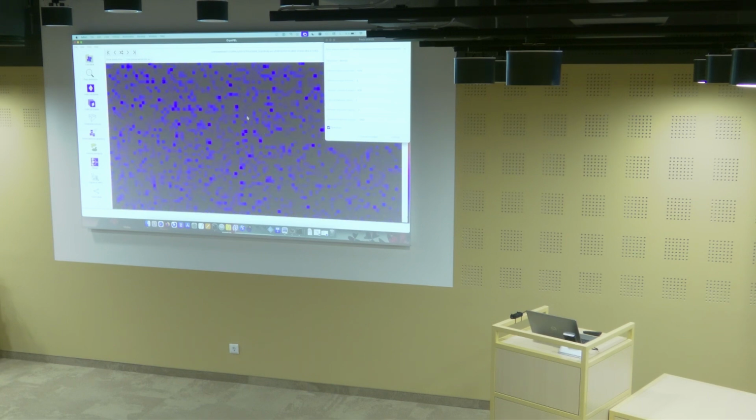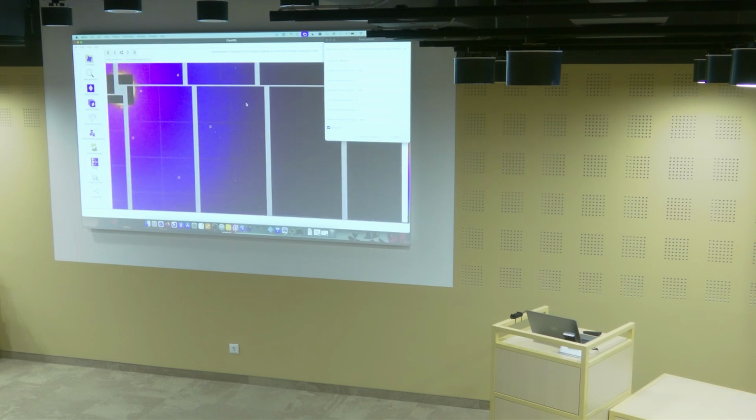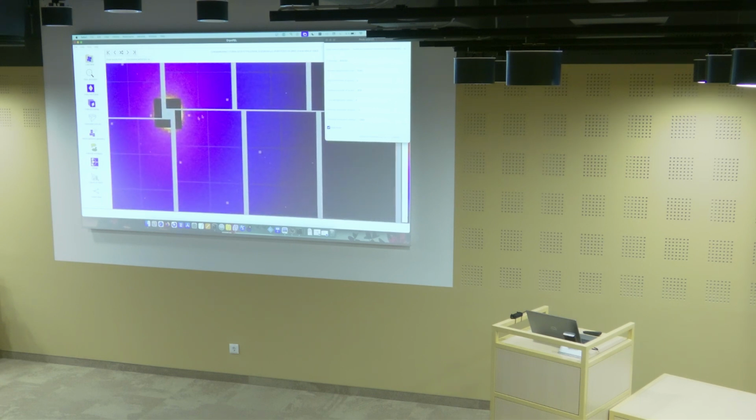So basically we want to select a value where these peaks, which are in a lower regime, are selected, but also the peaks over here are selected. So we know over here it's about 60 or something like that. So the value of 800 is definitely not good. So we can try something like 60, and if we do that, we can see if peaks are selected.